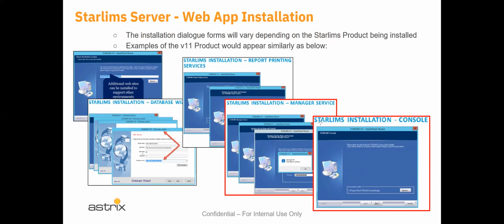So these are some of the types of screens that are in the installation process. This is again the overview of the application installation. There isn't going to be a great lot of detail about what's contained in all of these forms, but it does guide you in a wizard-like fashion from one step to the next. It prompts you for information as you're going. And once it's received all of that input, the final step would be to install, and off it goes with all the information you've given it.